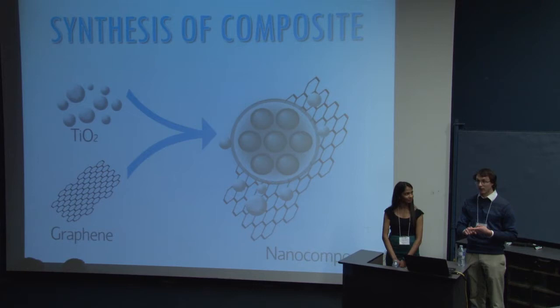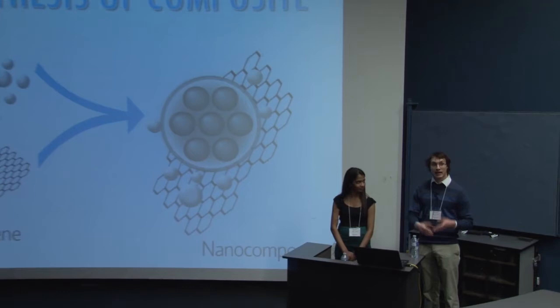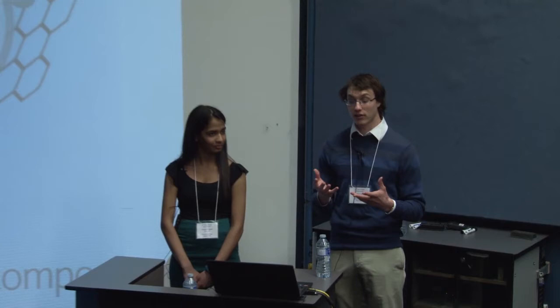We add these three components, magnetic particles, titanium dioxide, and graphene oxide, into a hydrothermal reaction and heat it up to 200 degrees Celsius for about 12 hours. What that does, it's going to induce the formation of covalent oxygenated bridges. We're essentially just doing a condensation reaction to link hydroxyl groups on the titanium dioxide and silicon dioxide surface directly to oxygen groups on the graphene oxide, forming a permanent covalent linkage. This means that we'll be able to withdraw all the nanocomposite, including the titanium dioxide, from solution when a magnetic field is applied.